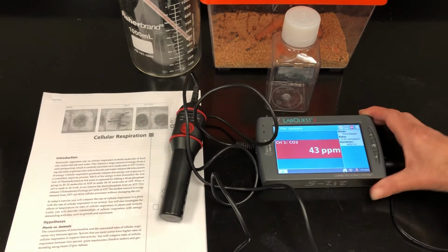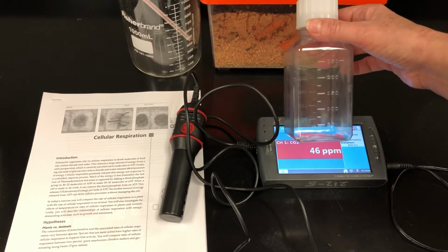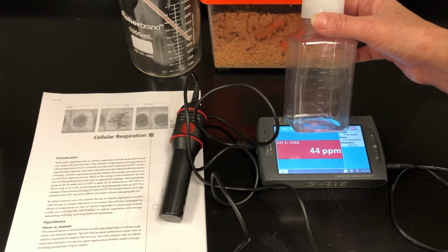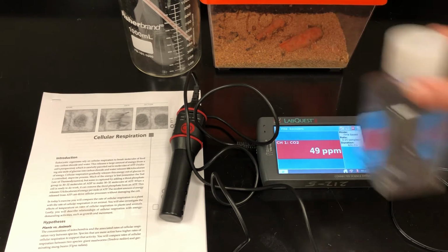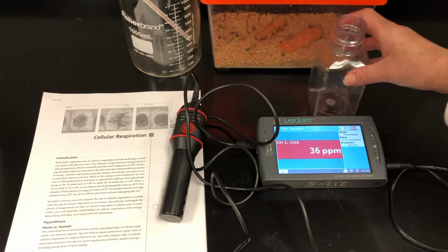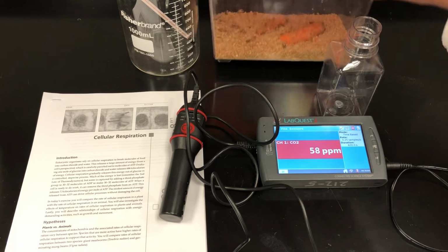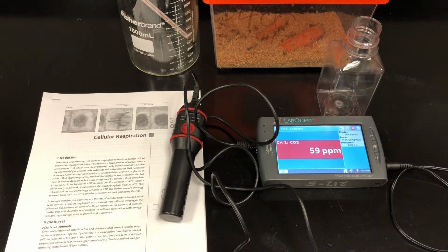So in this lab, we're using these respiration chambers, or what we sometimes call metabolic chambers. And you can put in them any type of organism you want. Typically, we are going to be doing this lab with two different organisms. We're going to be using these giant worms that are in here. They are beetle larvae, megaworms they're sometimes called, for an animal.